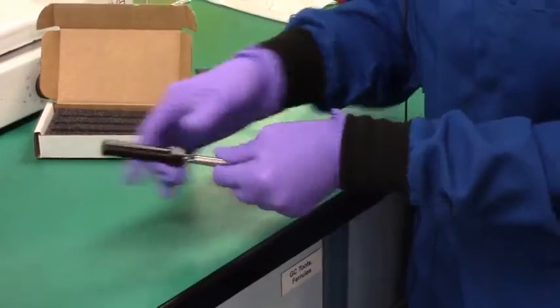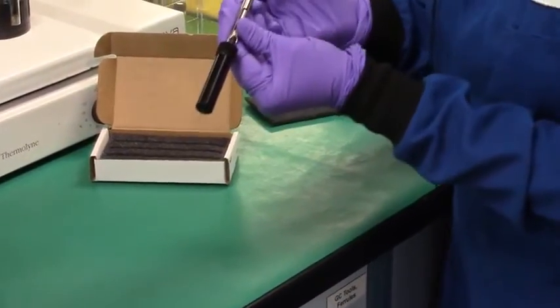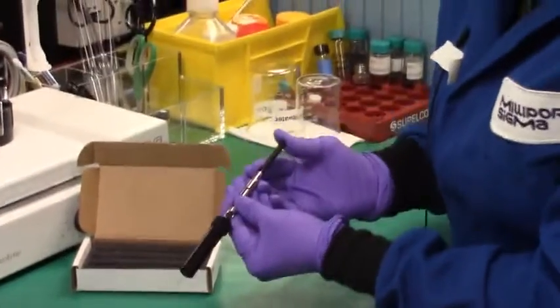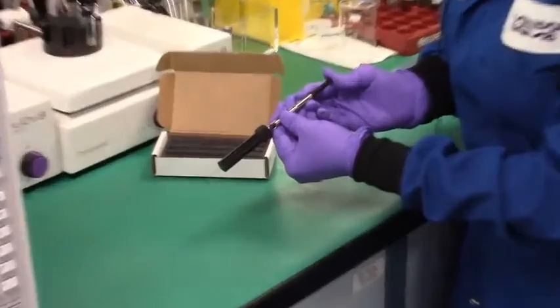Okay, I've now got the assembly all installed in the holder, and then to expose the fiber I just push down on that plunger, and you can see the carbon fiber, which is black, exposed out of the needle. So our next step then is going to be to get our fiber ready to use, so we're going to condition it to clean it off.